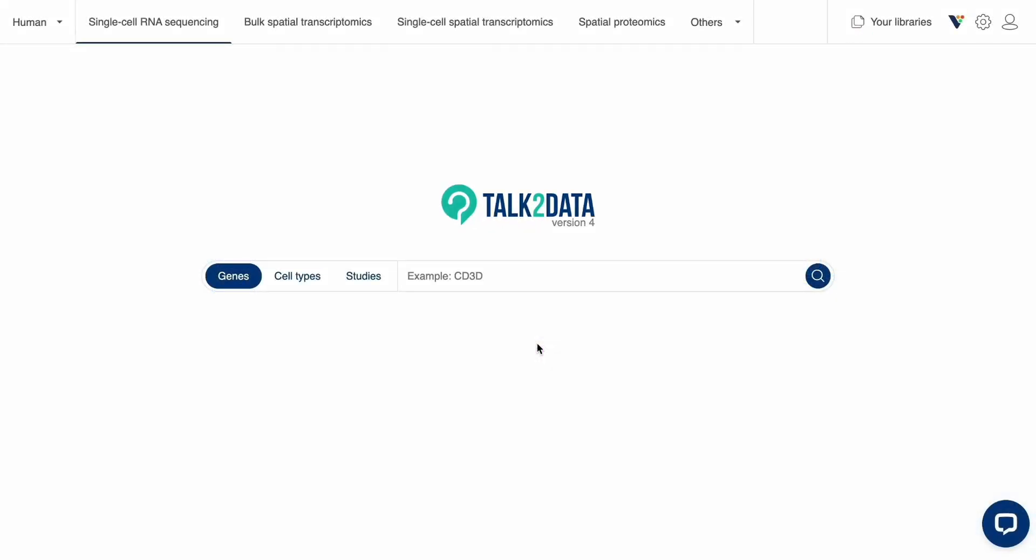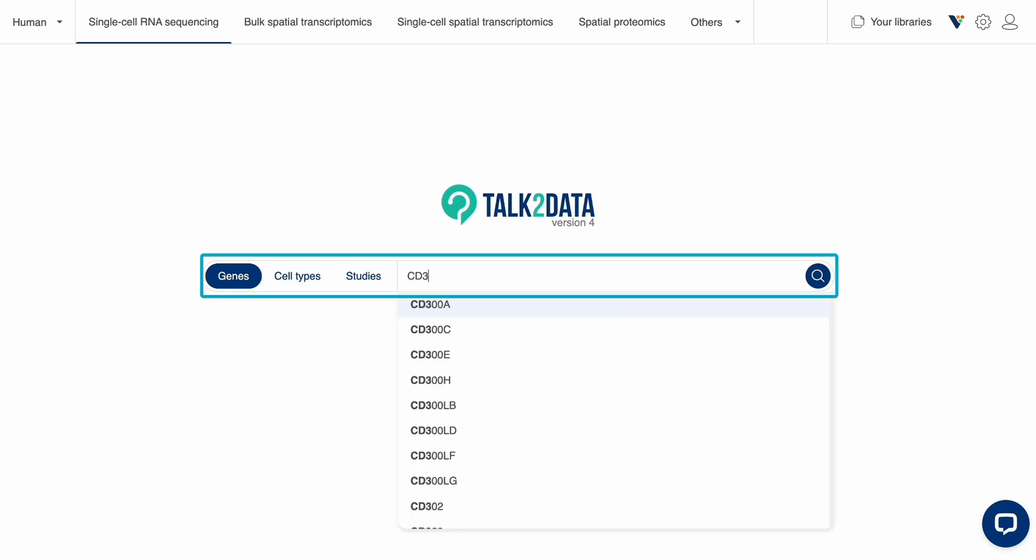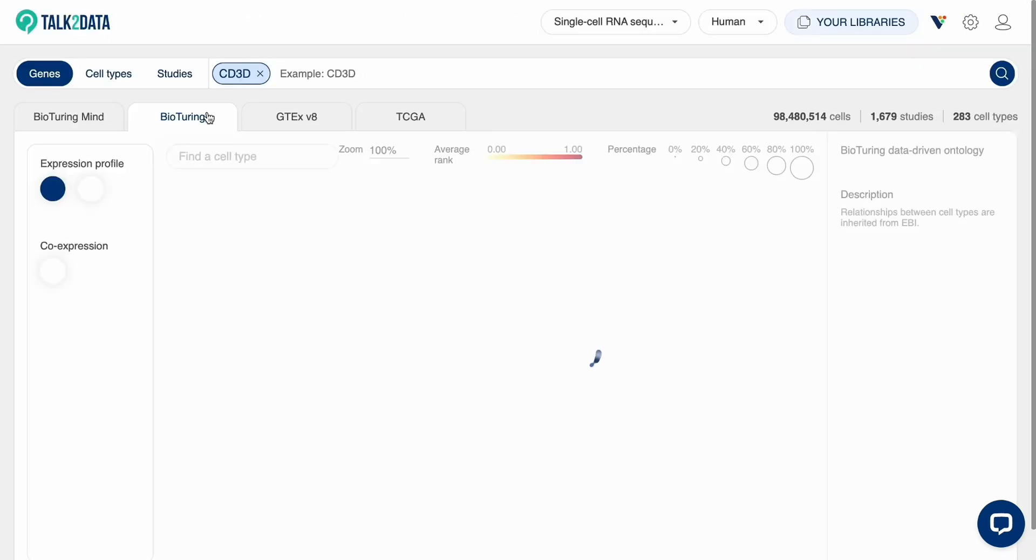In Talk2Data, you can quickly query for expression of a gene or set of genes among cells in our database using the Gene Search tool.